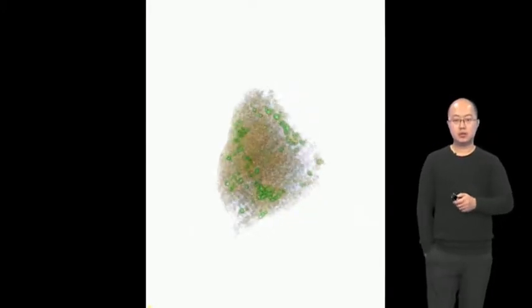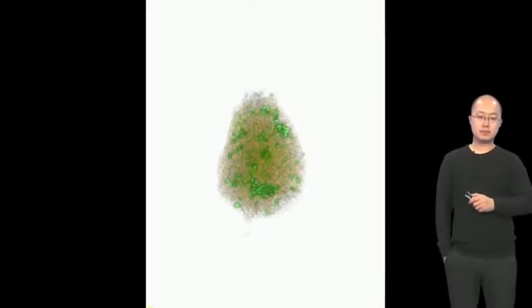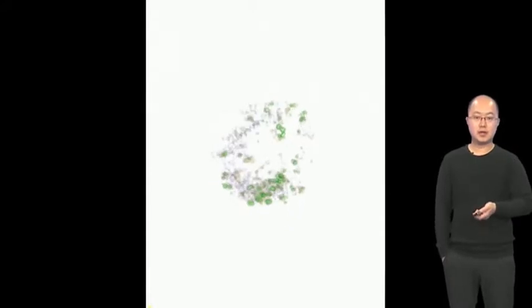And this is one example of a cell undergoing necrosis. Please watch. After some time, boom. So this is the cell dying.